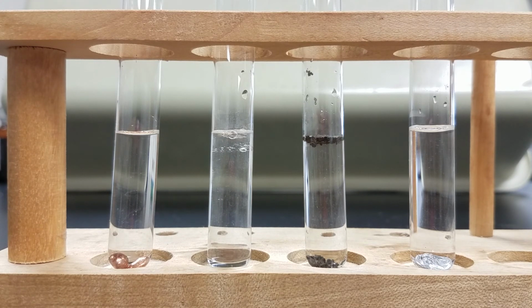Nothing's happening. So with the copper in the zinc sulfate, I did not get a reaction. I got some bubbling, some fizzing with the magnesium in the zinc sulfate, and then with the iron and the zinc, I did not get a reaction.